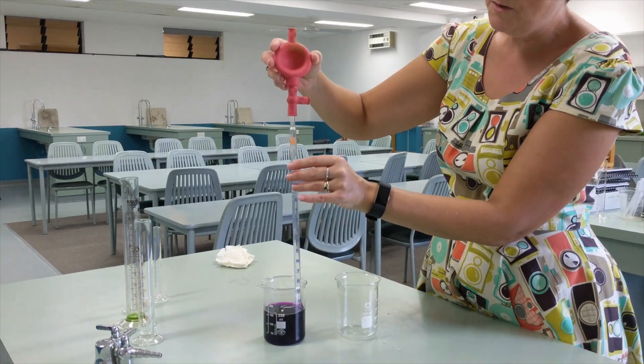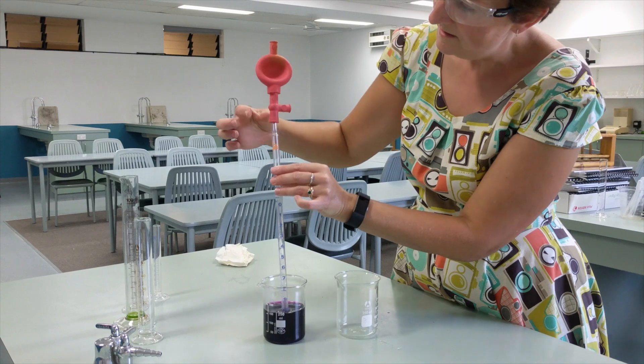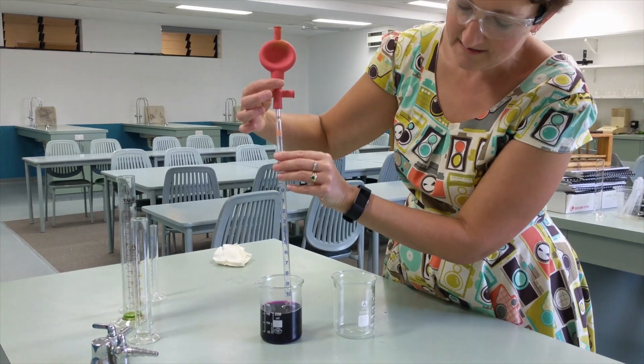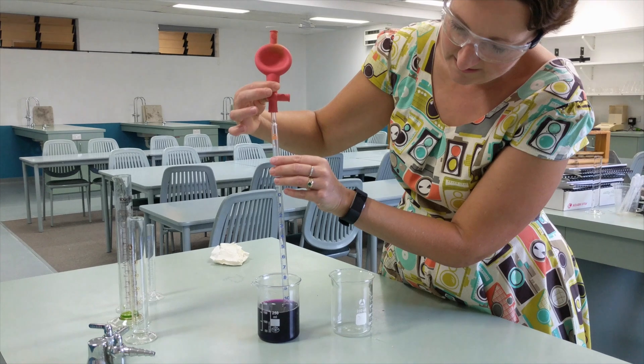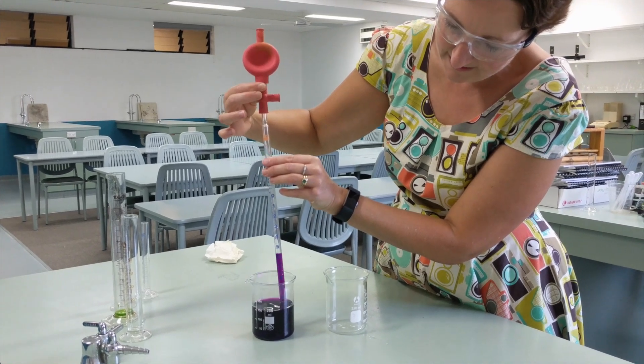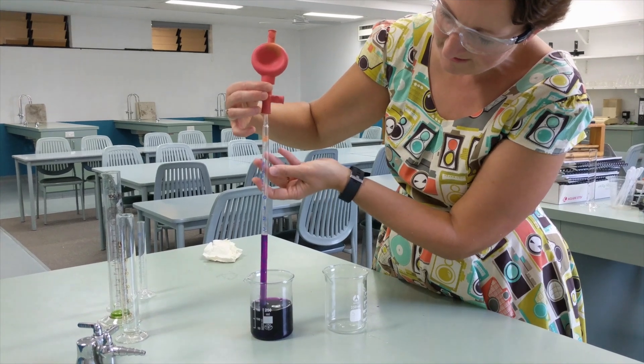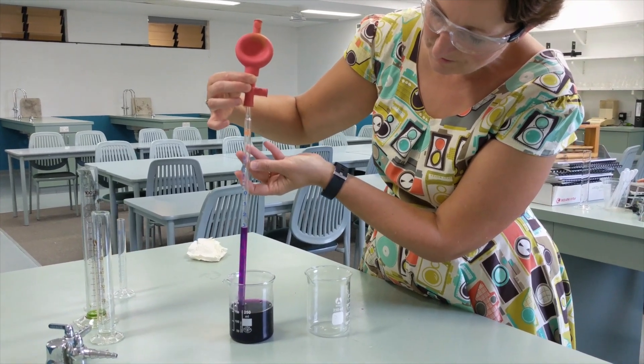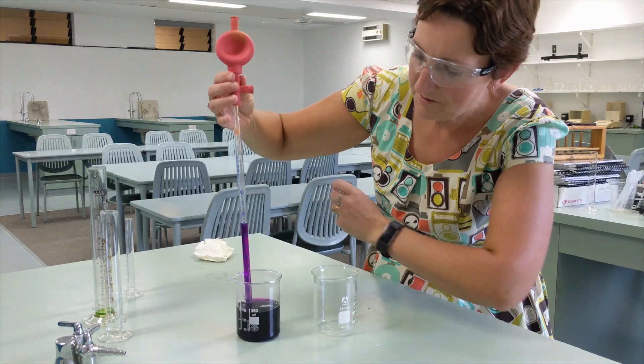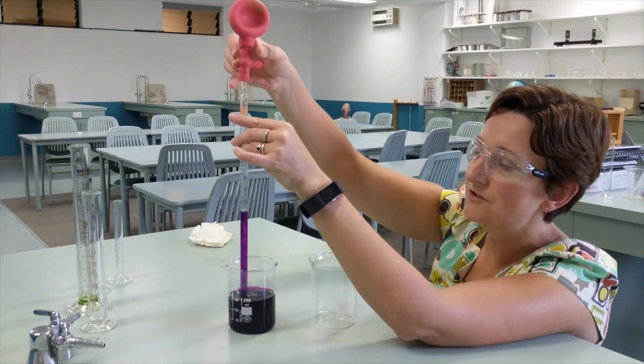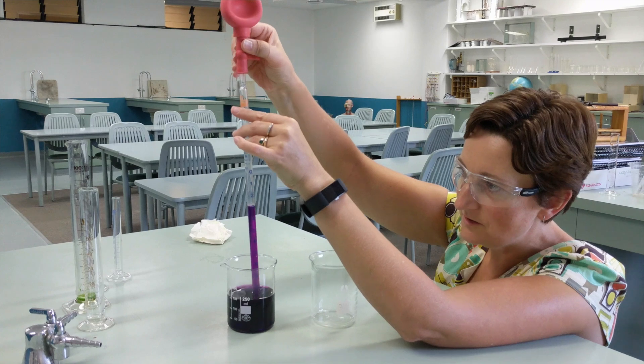What we then do is hold the pipette and squeeze the S. S stands for suck. You can squeeze it quite hard and it will suck up really fast, or you can squeeze it more gently and it will suck up more slowly. Again, you want to get down to eye level to make sure you're sucking up an accurate volume.